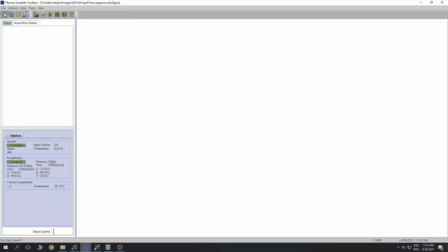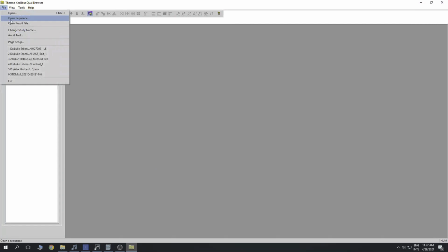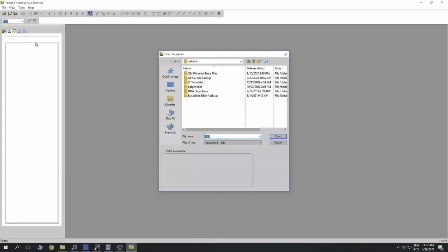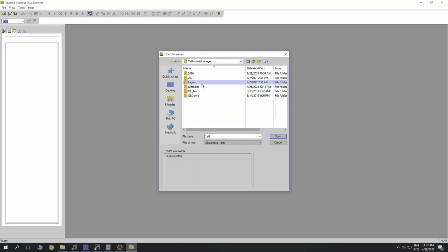To analyze your data, you'll open the Excalibur Qual browser program. You'll open the sequence that you're interested in looking at. So I'm just going to open my latest sequence. And then you'll select a sample.